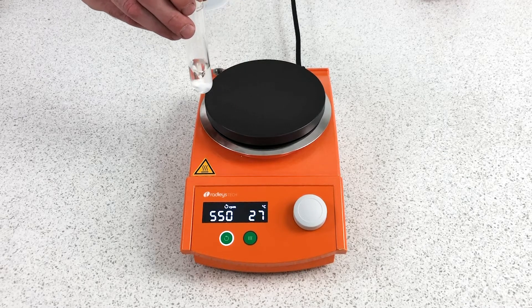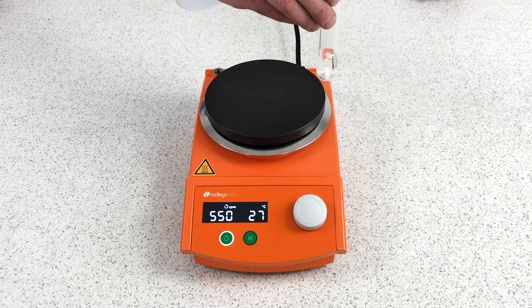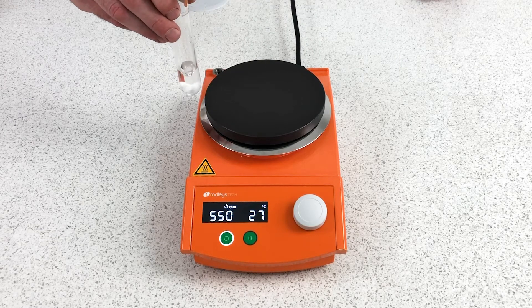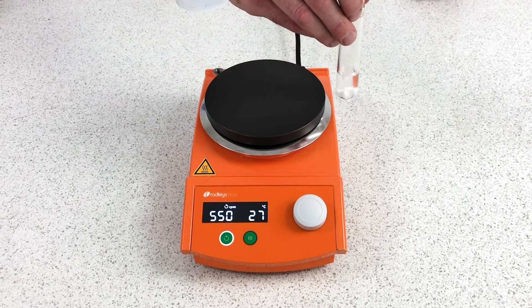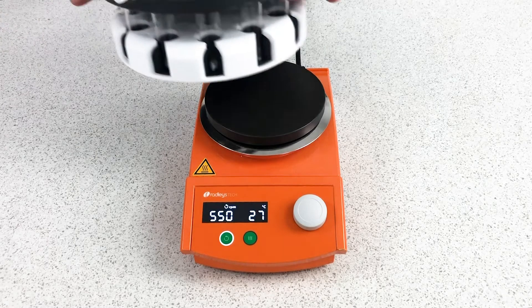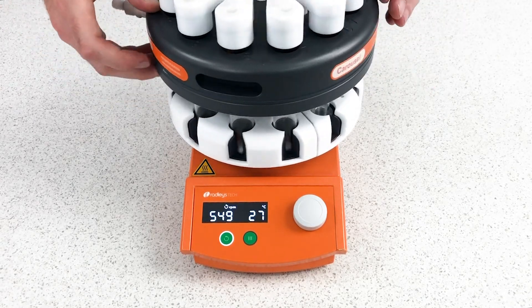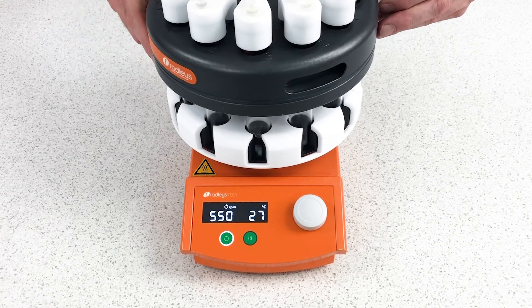You can see the magnetic stirrer bob bouncing around. But all the way around the outside of the hot plate, around the edge, we get good even stirring with a secondary magnetic field. This means all the positions of the carousel are going to stir at exactly the same speed, in the same way, and be held at the same temperature. If I lift the carousel, you can see the tubes are held in exactly that position, and they're all stirring from just that one single hot plate.